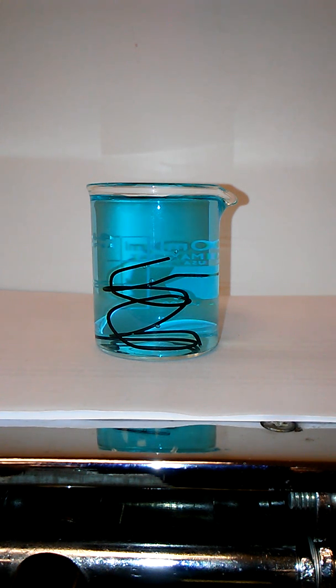So, while that starts to react, we're going to do the reaction equation up here. So, iron metal, of course, is simple, Fe. And the metal part, we're going to note with an S for solid. Reacts with copper 2 nitrate solution. I suppose I'll stick with the red color for that.